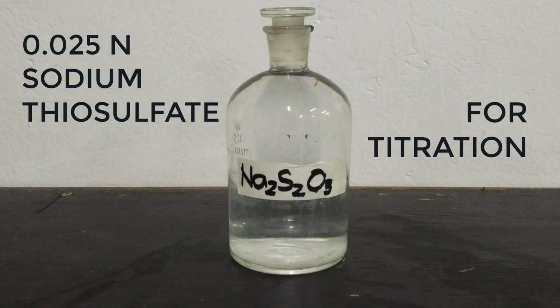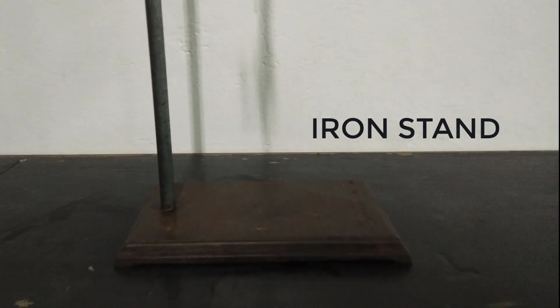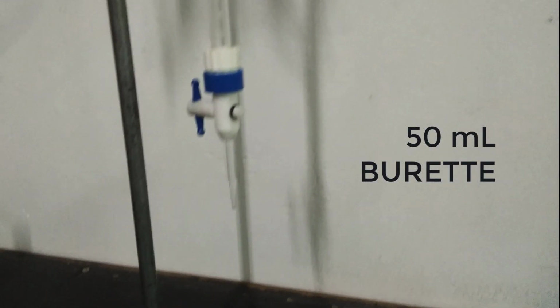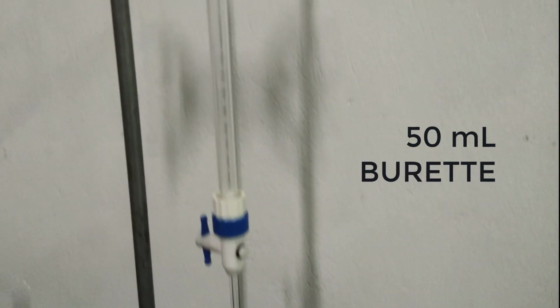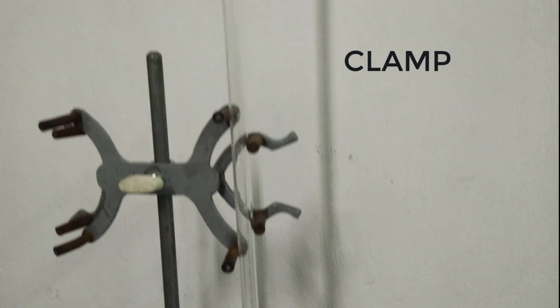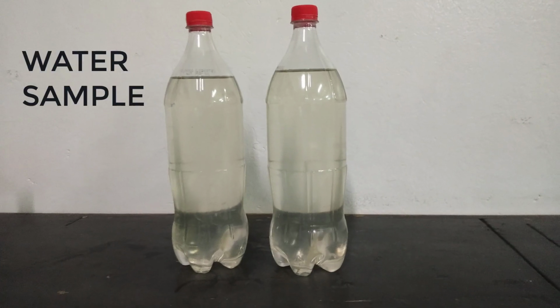Sodium thiosulfate, iron stand, 50 ml burette, and of course the clamp to hold the burette. And don't forget your water sample.